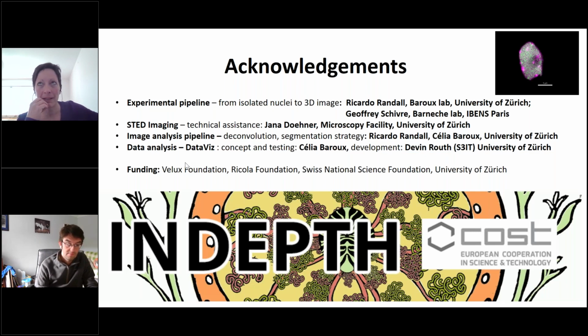I mean, in the end, it's very pragmatic. The person who develops the software for me, it's a contract-based service, and I need to have funds basically. We are nearly finished with the funds I had with them. He's going to finish some current interface. Any future implementation requires more funds. As soon as I have, yes. Yeah, but that would be interesting.